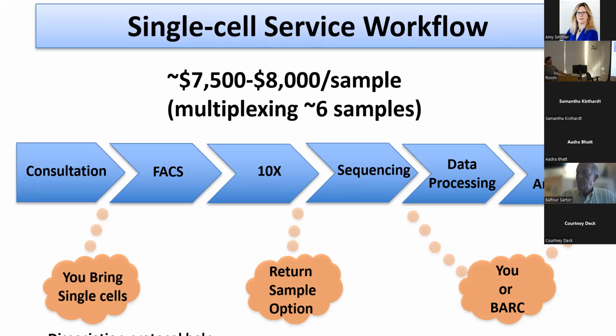The next thing is the single cell part of it. So I was talking about bulk sequencing, the populations of cells. We're now moving on to the single cell service workflow. I'm going to talk about the 10x because that's what we currently offer.